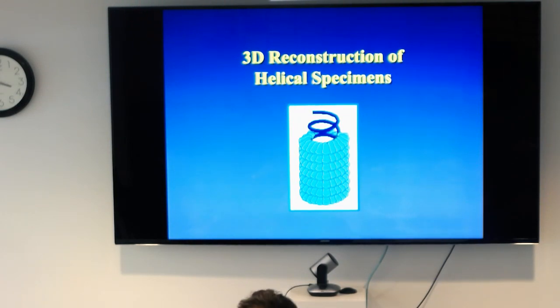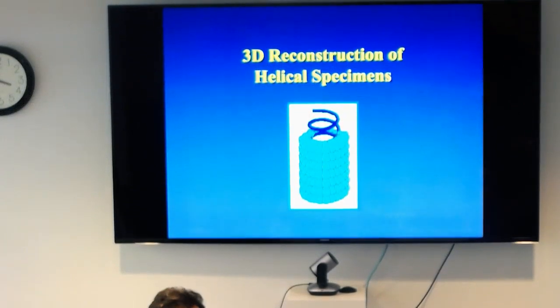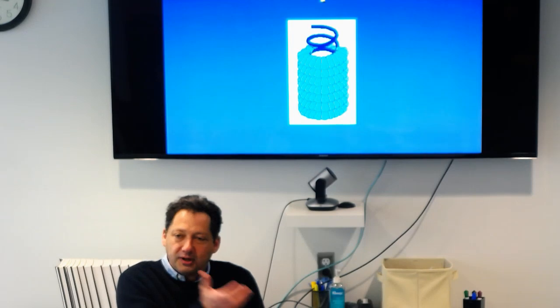And if anything, what is good about helical specimens is that they will help reinforce some concepts that you will need to know as image processing in general, because we're going all the time back and forth between the Fourier transform, when you use the Fourier transform to analyze your images, and what that gives you in order to understand your specimen.